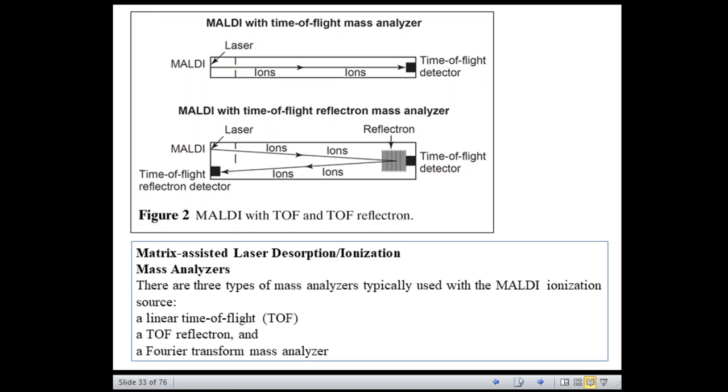Now similar to that, we have the TOF reflectron. This TOF reflectron combines the TOF technology, the previous one, with an electrostatic analyzer, that is the reflectron.